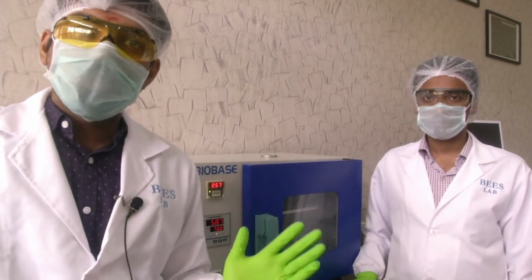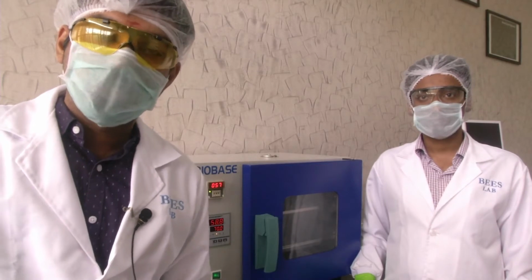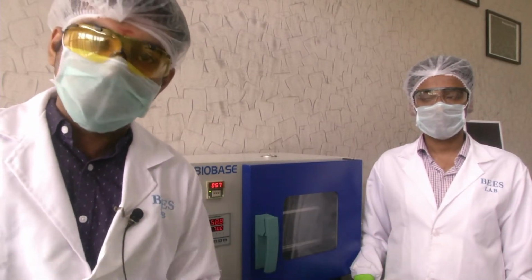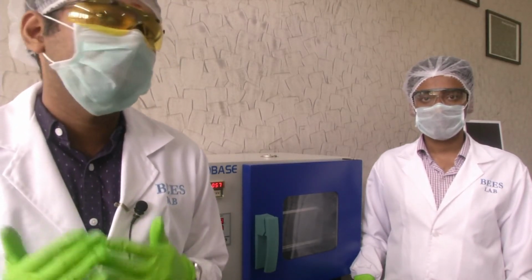Your outside environment might be an air conditioned lab, set at 20 or 22 degrees Celsius. Inside the oven it is 70 degrees Celsius. If you suddenly open the door and take your glass petri dish out, it will simply crack. That is called thermal shock. Please do not give thermal shock to your equipment.